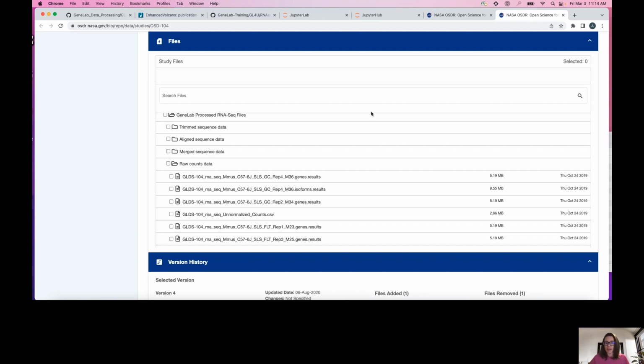Any questions on navigating the new system? I just want to be reminded, the raw counts data are already being filtered, right? Normalized? No, we are going to do the normalization. I thought you wanted us to get the counts table. Oh, that's exciting.